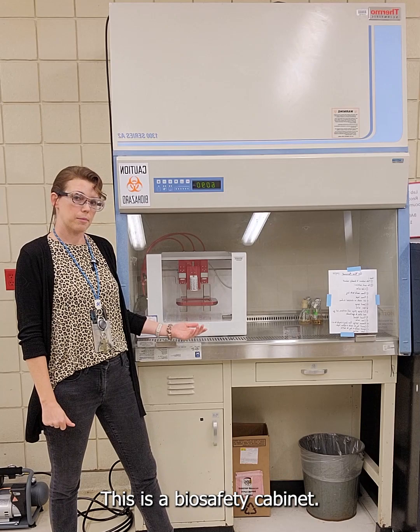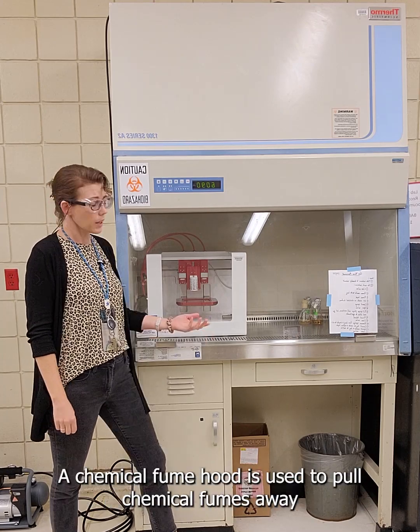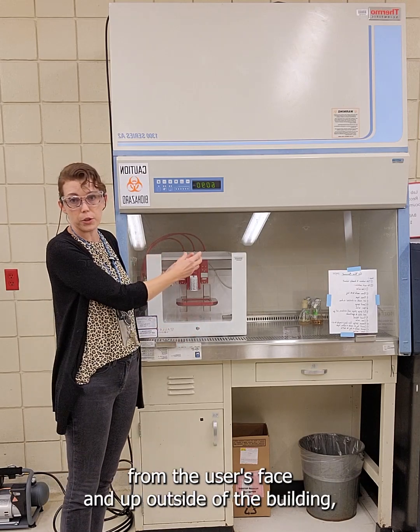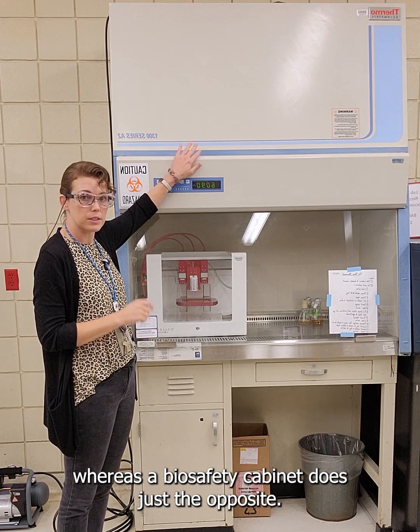This is a biosafety cabinet. It might look like a chemical fume hood but there are a few differences. A chemical fume hood is used to pull chemical fumes away from the user's face and up outside of the building, whereas a biosafety cabinet does just the opposite.